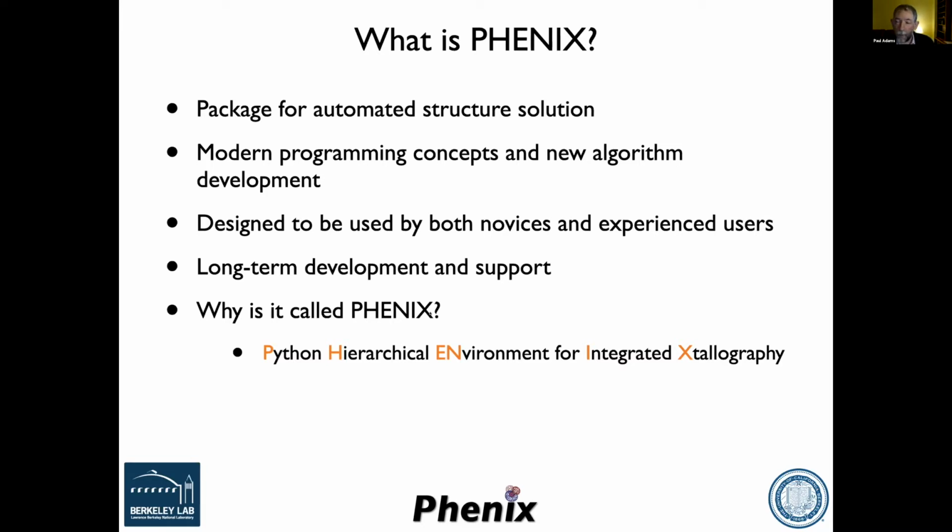You might wonder why it's called Phenix. It's called Phenix because it's based around a scripting language called Python. 20 years ago, most people didn't know what Python was. I think now everybody does because it's used a lot. It's used a lot for things in the context of machine learning. A lot of tech software that's developed is based around Python these days.